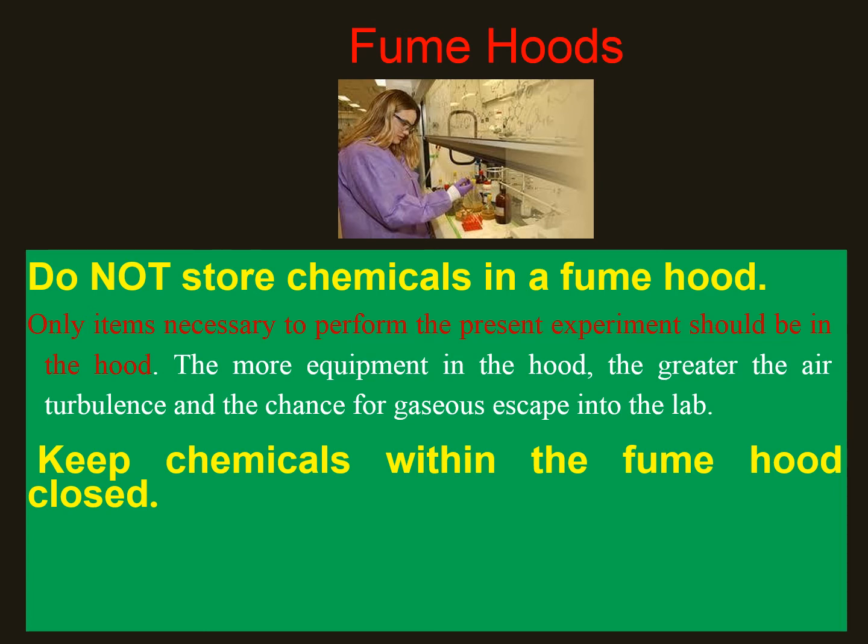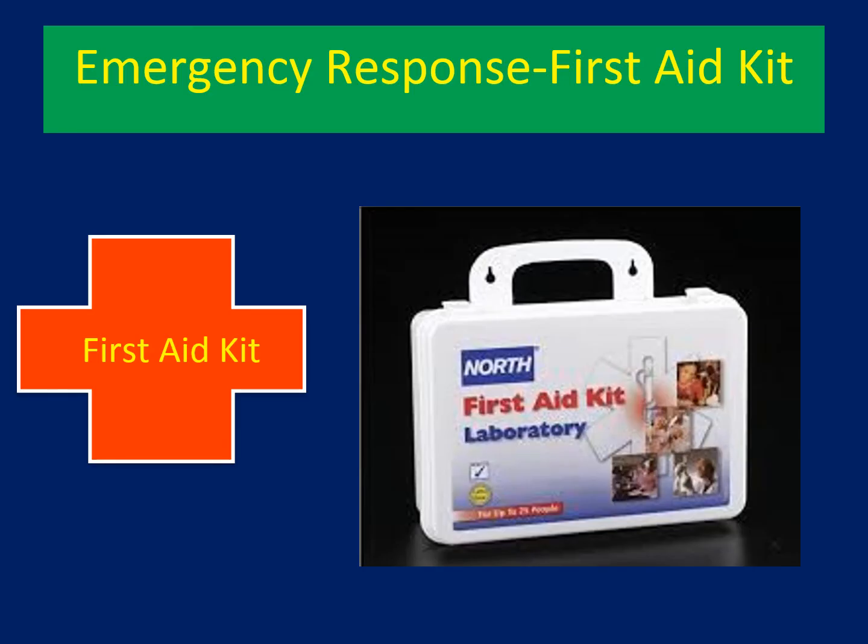When you are using fume hoods, make sure not to store many chemicals inside the fume hood. Keeping many chemicals inside the fume hood gives a greater chance of those chemicals escaping into the lab environment. So that might be toxic in that case. And also make sure to close the chemicals inside the fume hood. Let's look at the emergency responses and first aid kit in the following slides.